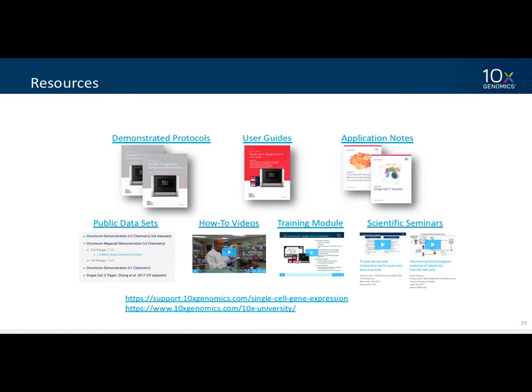Another thing I want to mention is we're always here to help, and the lab is always very much accessible. If you are not sure whether your cell preparation protocol is good enough, we recommend you do a couple of rounds of testing. If your samples are clinical samples, there's nothing we can do about that; we have to do whatever we need. But if it's cell-based or an animal model, and you can spare some of the samples, we recommend you do the testing, and then bring your cells to our lab, just pretending we're going to run. Then we will check the viability, the quality, the concentration, check everything, and when it works, then for the real deal, that increases our success rate.